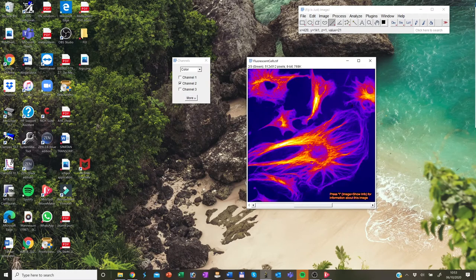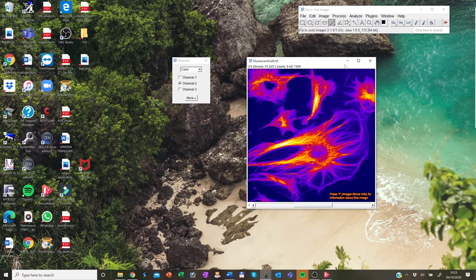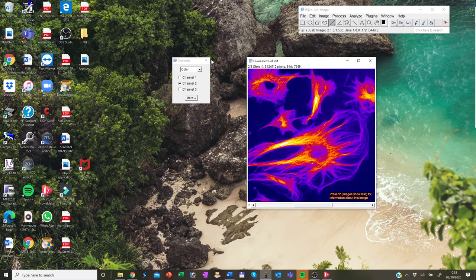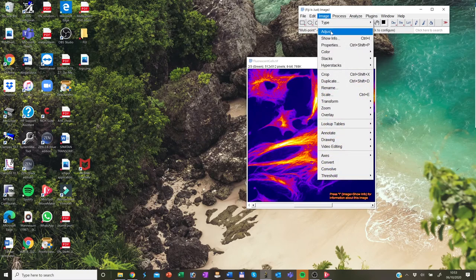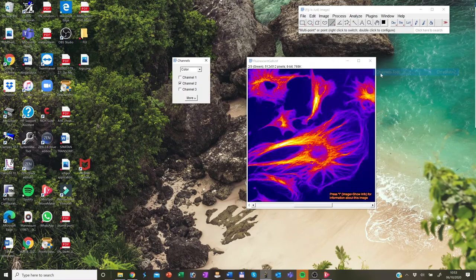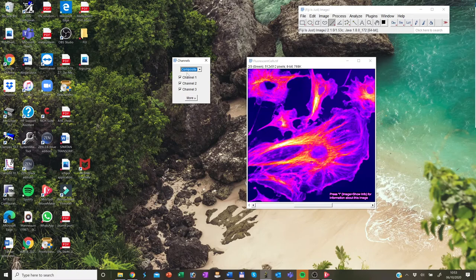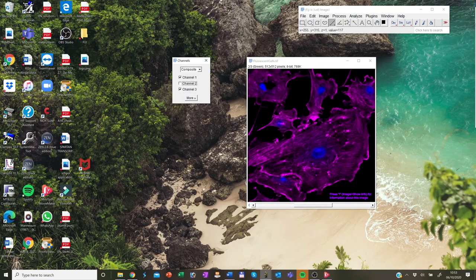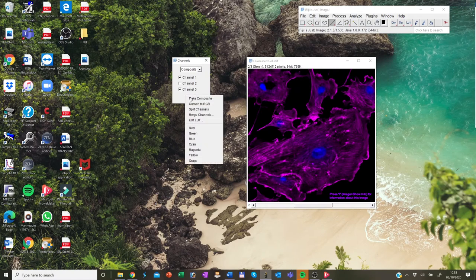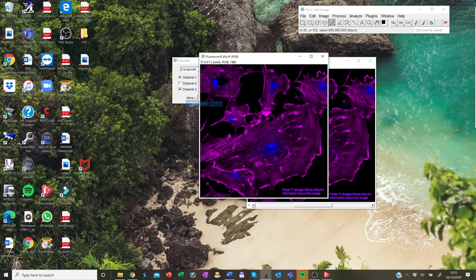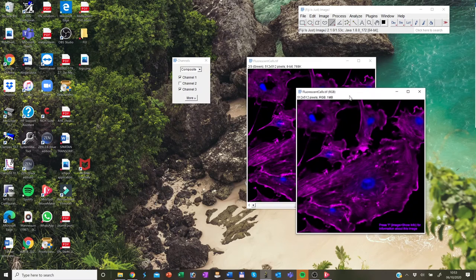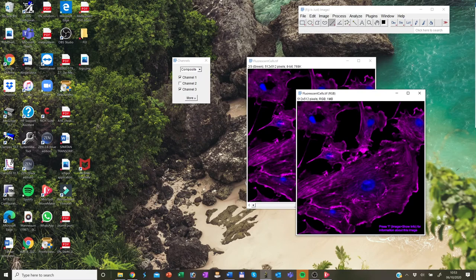Now, multi-channel images cannot be imported into PowerPoint, Word or Illustrator. They have to be converted to RGB format. And for this, use the channel tools window. So in channel tools, we go on composite mode, the selected channels that you would like to display when you save it. For example, I want to save channel one and channel three as an image like that. So I click on more. And then I choose convert to RGB. Now this will create a new window in 8-bit RGB format. And that can be used in PowerPoint and other presentation software.